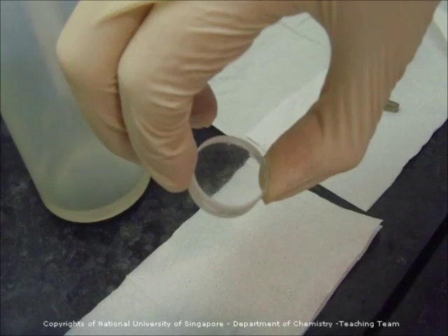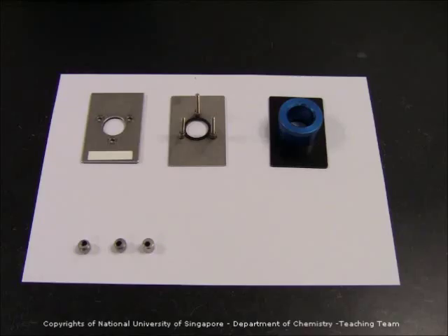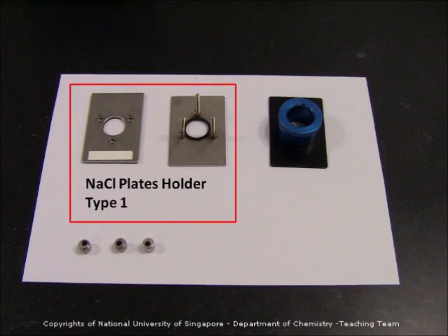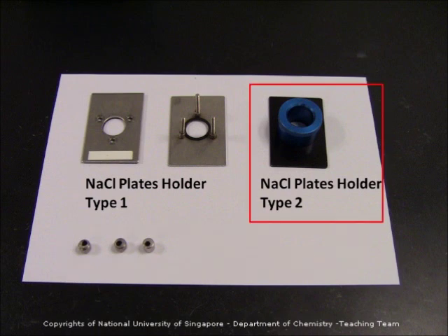For liquid samples, you need to use a pair of sodium chloride plates. Here you see the two kinds of sample holder that are used to contain your NaCl plates. This is the sodium chloride plates holder Type 1 — there are three entities to it: a case, a basement, and three screws. And plate holder Type 2, which is an easier fixture.